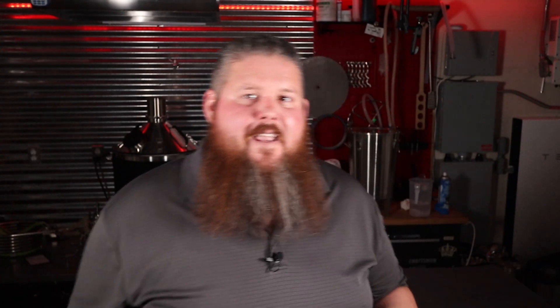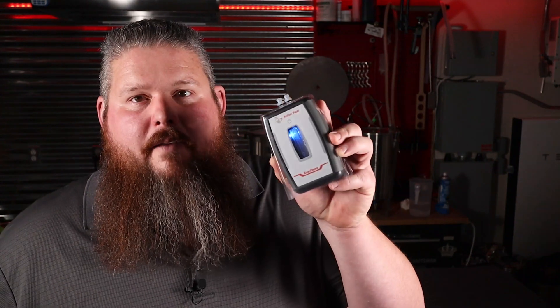It might throw off the reading by like a tenth. This thing makes like a spaceship sound. It's got a little blue light in there, but when you're pulling a sample it just sounds like science. I don't know how else to explain it. I got a big kick out of it — listen to that. That's the sound of science. It has to be.